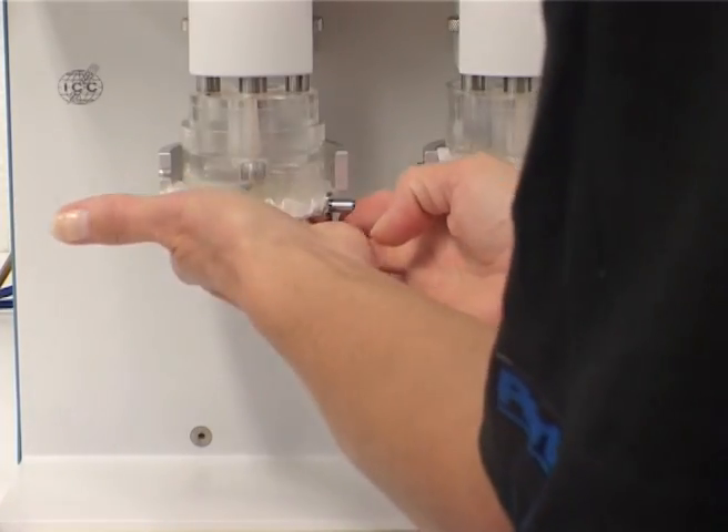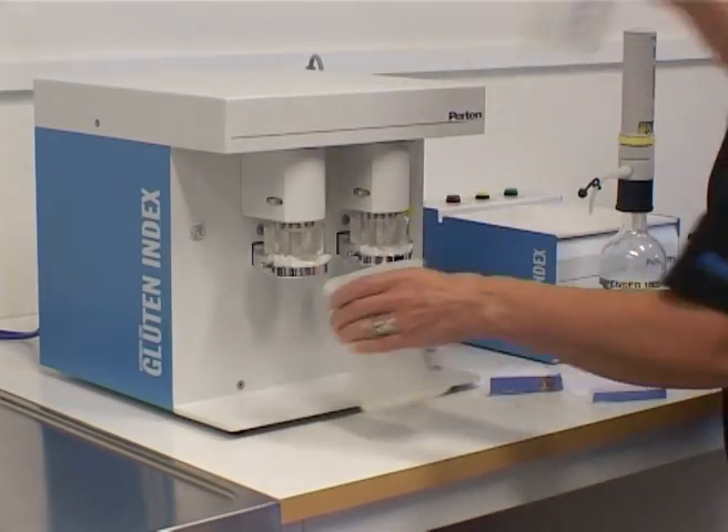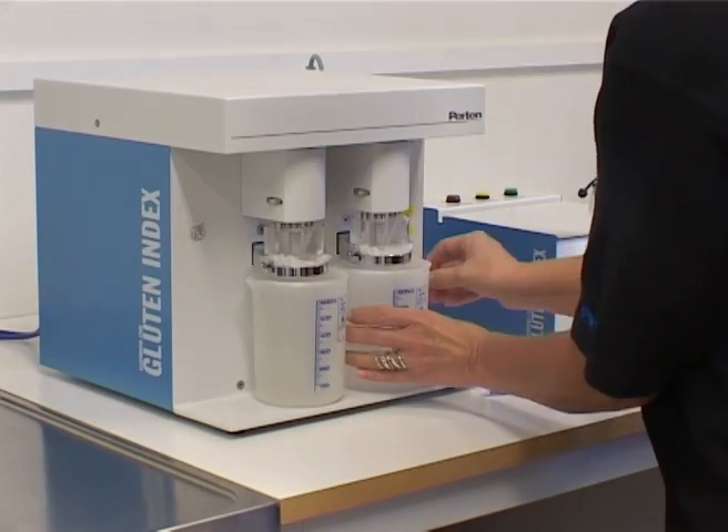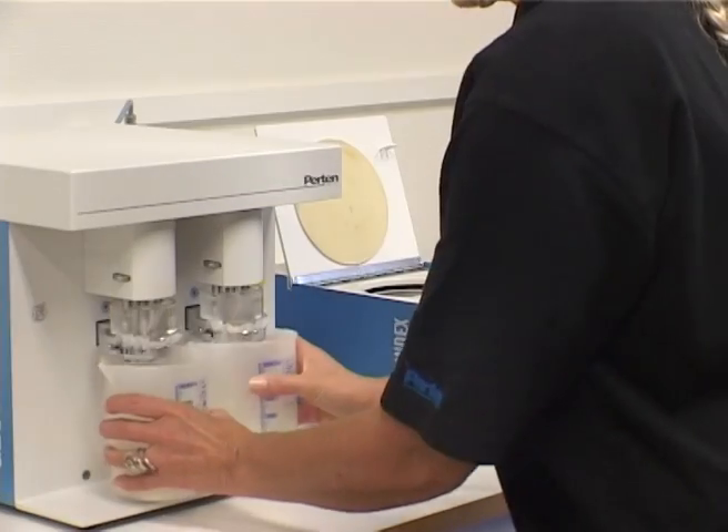Place each wash chamber in its position on the Glutomatic and the collecting cups under the wash chambers. Press start. When the washing stops, remove the wash chamber.